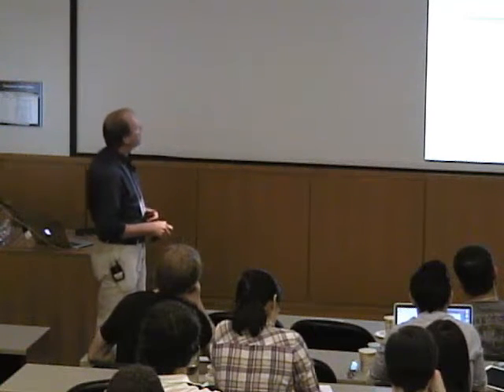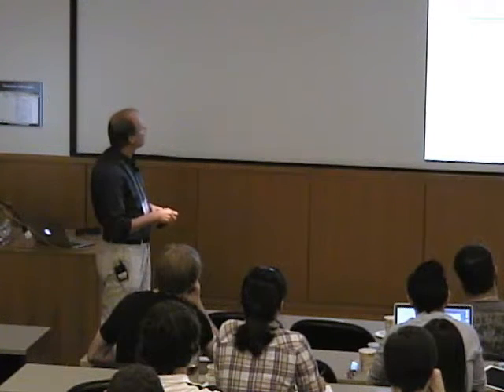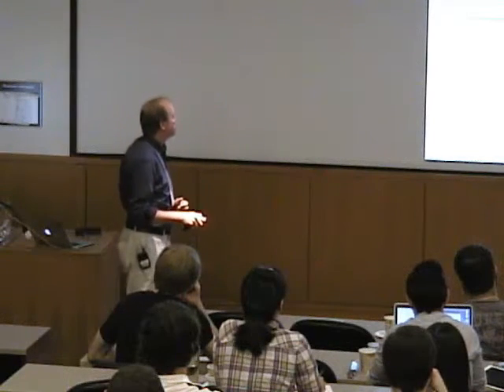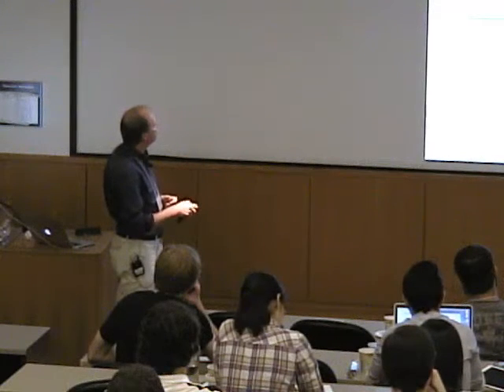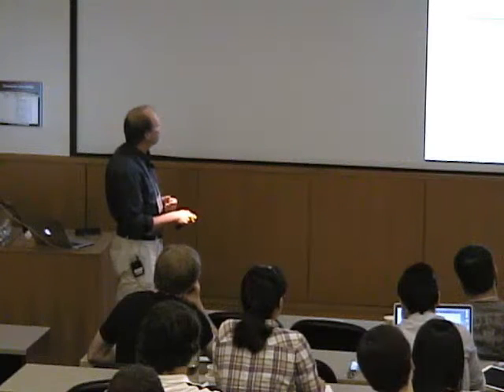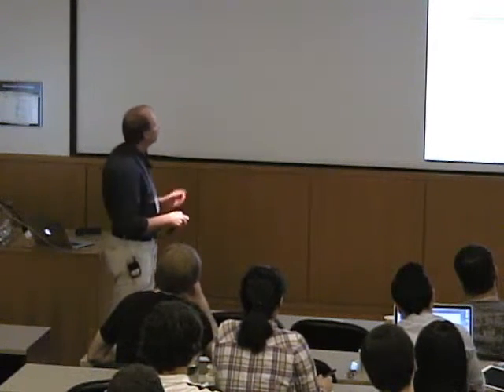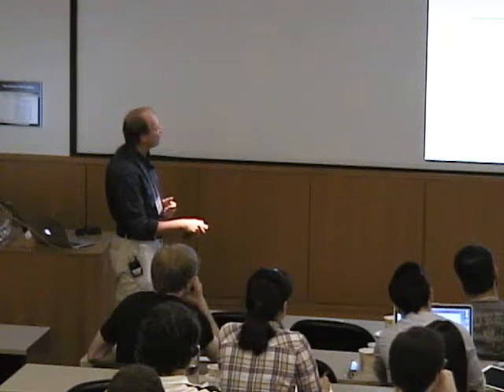And depending on the shape of this opening, so where we have the screw set, the amount of power absorbed at the resonance frequency changes, right? If we have one shape, we would be what we call overcoupled, and you get the resonance here is a little bit broad, and at the resonance frequency, we have a fair bit of reflected power. And if you change the shape, then you can become undercoupled when, again, there's reflected power, but the shape of the resonance is narrower.